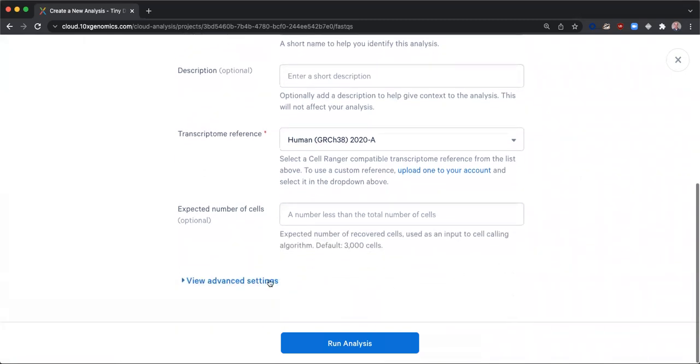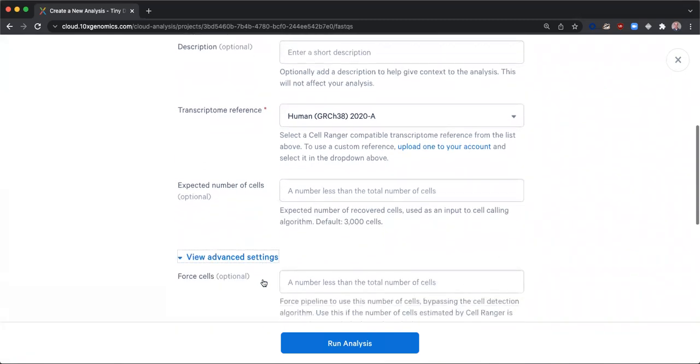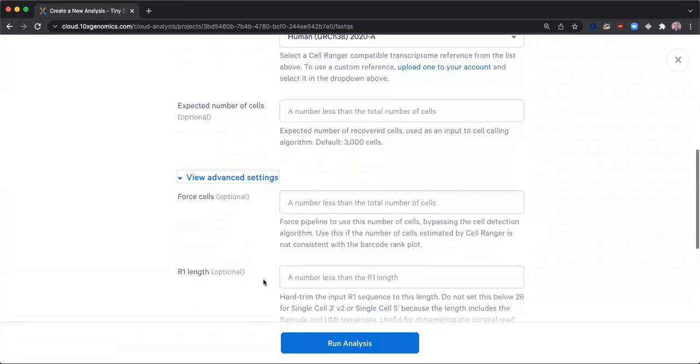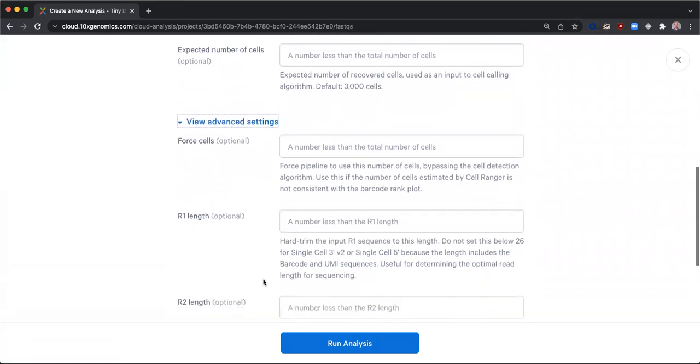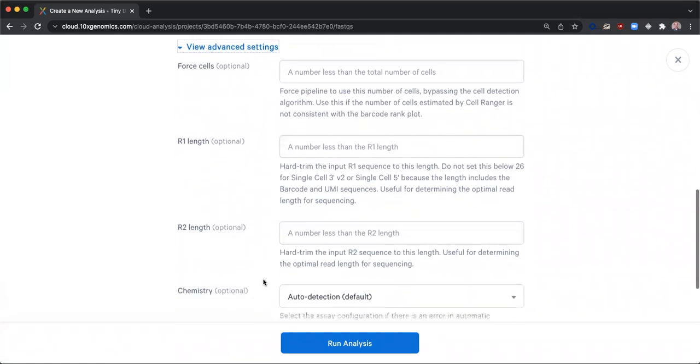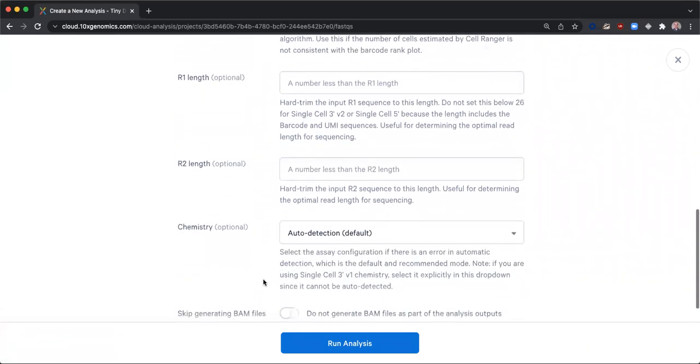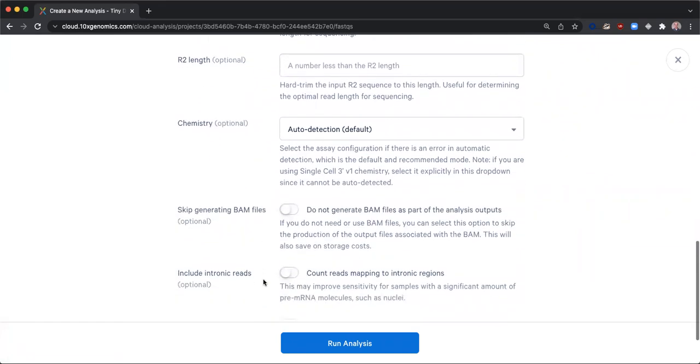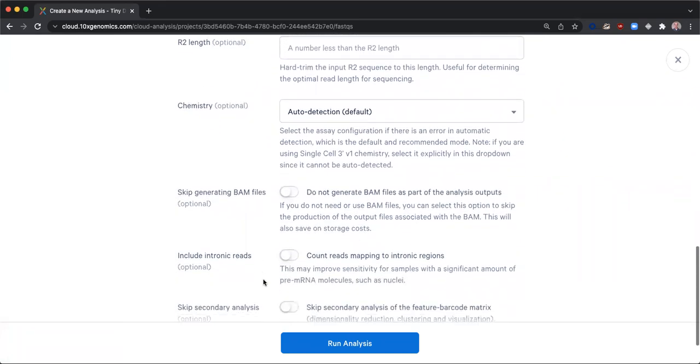Under advanced settings, there are many optional parameters that are appropriate in certain circumstances. Each field has a brief description below to explain usage and additional information is available on our support site. For this analysis, I will not utilize any of the optional parameters.